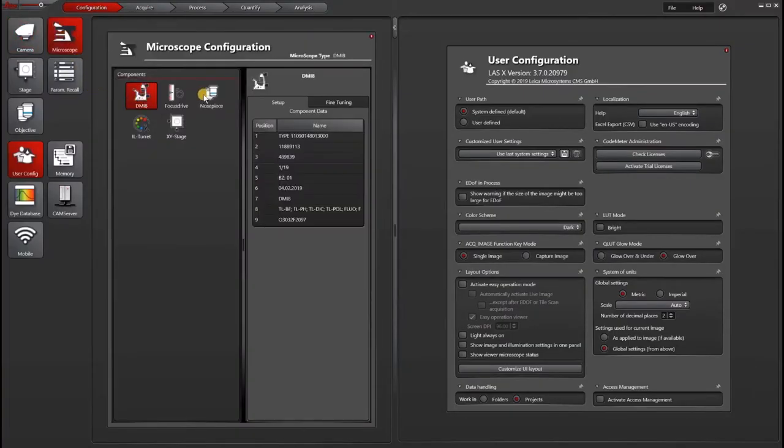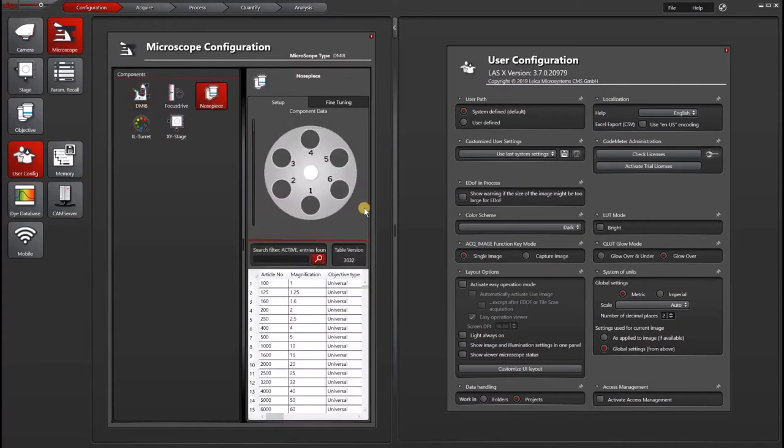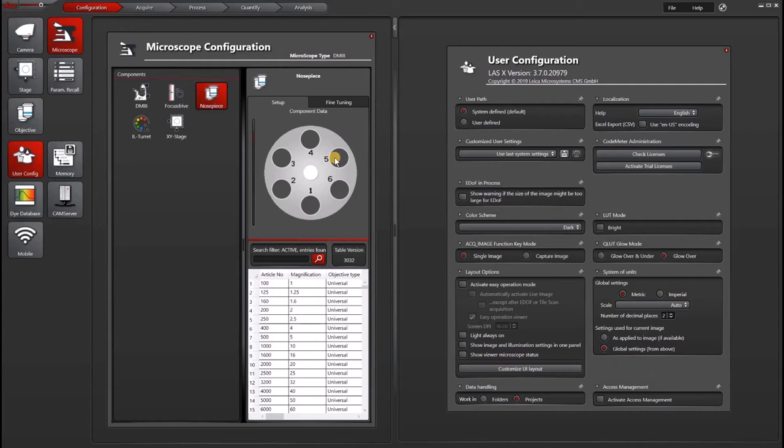Under the nose piece, you'll see positions for every position you have on the nose piece. These are actually written physically on the microscope, so you can look at your microscope and determine which position you want to replace.